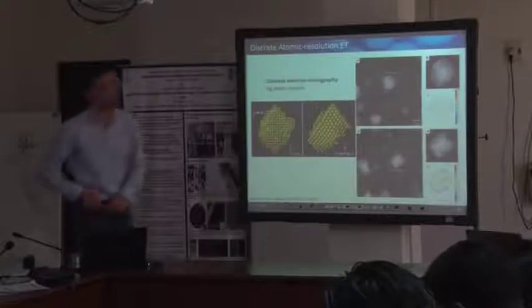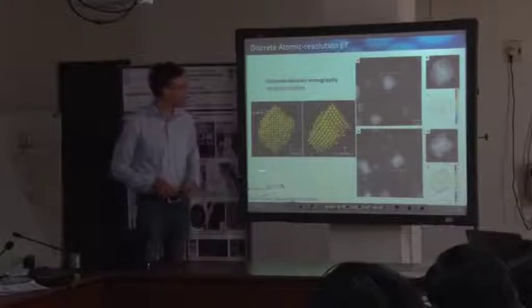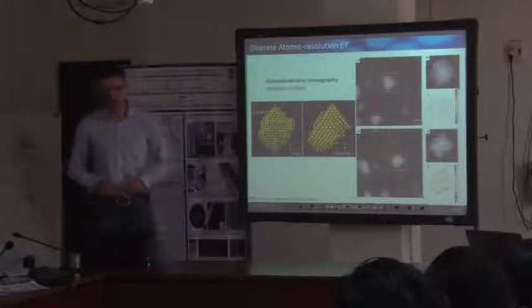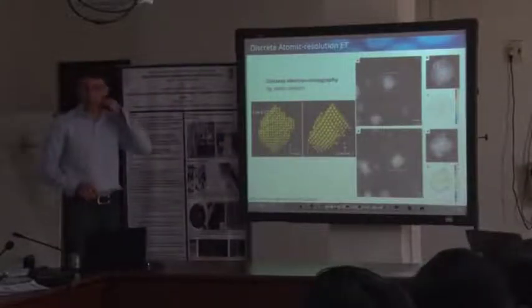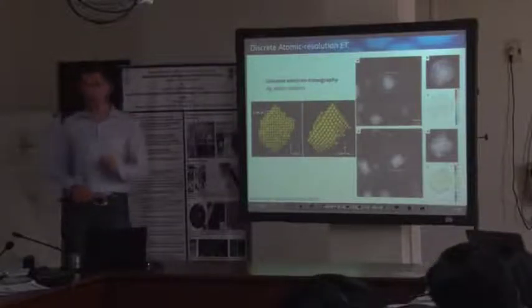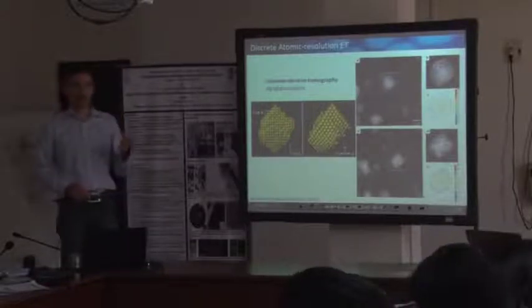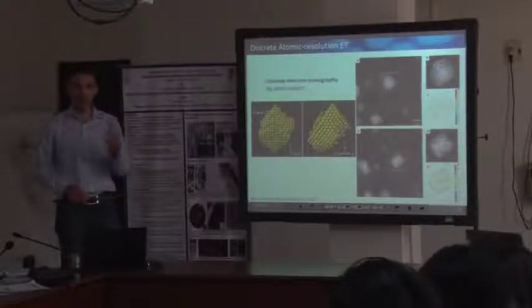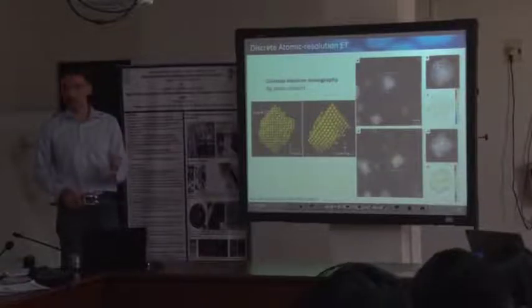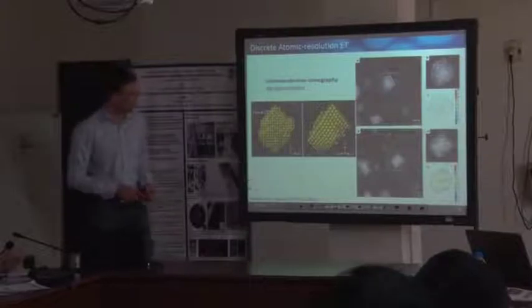And the last aspect that I want to address before we have our lunch break is atomic resolution tomography. There are different ways. We saw this tilt series acquisition. There's one example about even reconstructing the distribution of all the atomic species, like in nanoparticles, for instance, by acquiring tilt series. But there are some earlier examples.